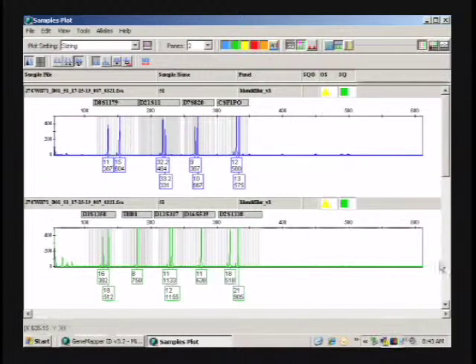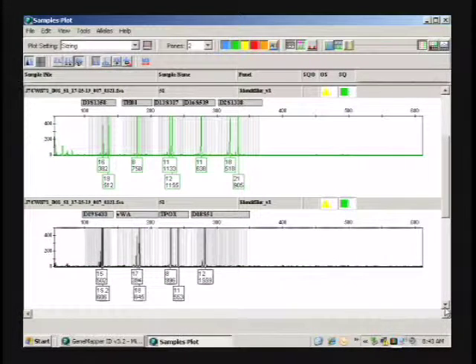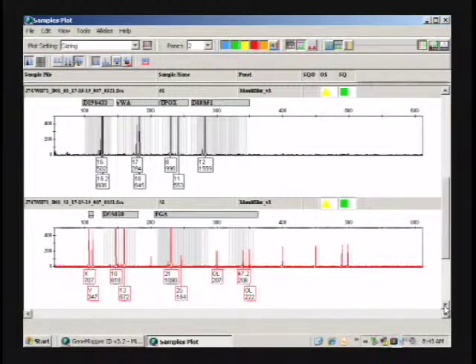Yes, this was a 0.1 nanogram to start with. Well, no, wait, number 51 actually wouldn't have been a 0.1. That would have been a 0.05. So it actually gave quite a big increase for the 0.05, and I was only adding 1 microliter. This is just a lot of pull-up from the Liz.